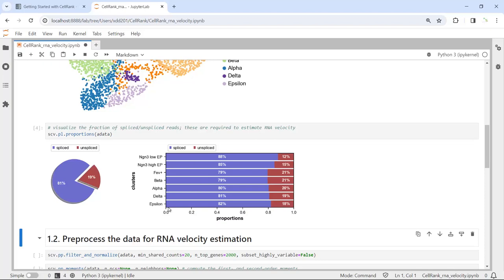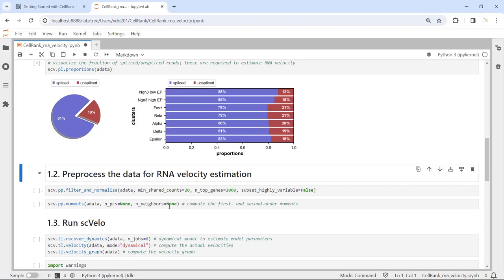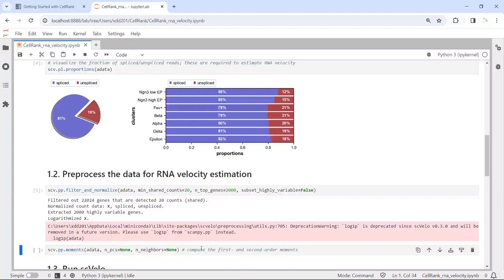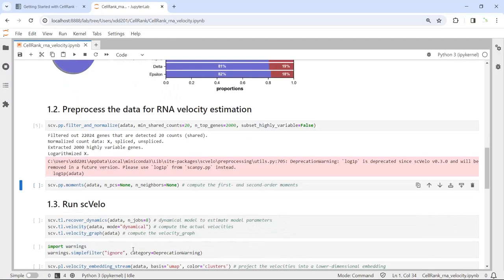Now we can perform the RNA velocity analysis using the scVelo package. First, we need to filter the spliced and unspliced mRNA, then normalize the data. Next, we need to compute the first and second order moments, which are required to estimate the velocity depending on which method you use in the scVelo package. Let's run scvelo.pp.moments.